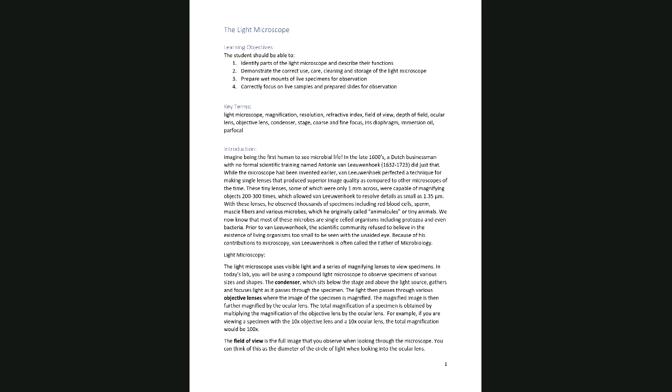At least you guys have taken 150, so you have a little bit of experience using a microscope. But in microbiology, we use a microscope a lot, so you would have gotten a whole lot more experience. We're going to go over all the parts of a microscope, which you're already familiar with, but also their functions. We'll show how to correctly use, care for, and clean the microscope. We're not going to prepare any slides because obviously we're not meeting face-to-face, but we'll talk about these kinds of things.